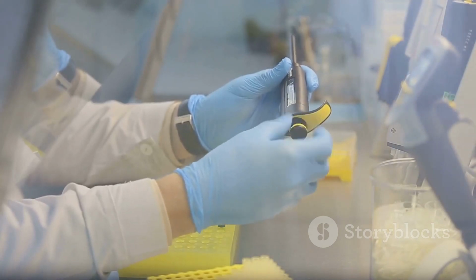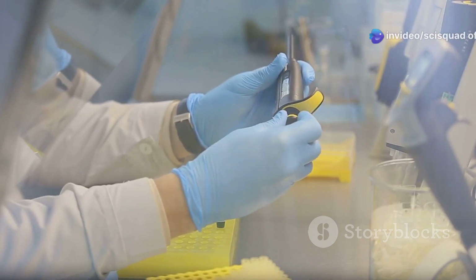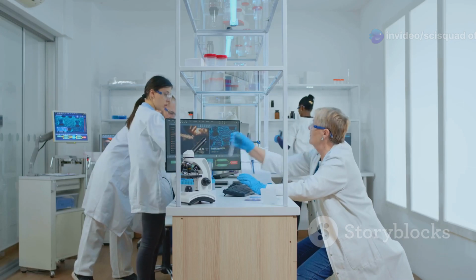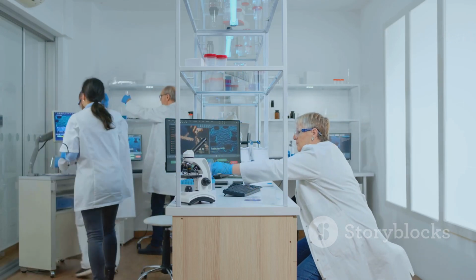Moreover, compared to newer sequencing technologies, Sanger sequencing is relatively inexpensive and easy to implement, especially for smaller-scale projects. This accessibility has made it a workhorse in research labs and clinical settings worldwide, democratizing access to genetic information.